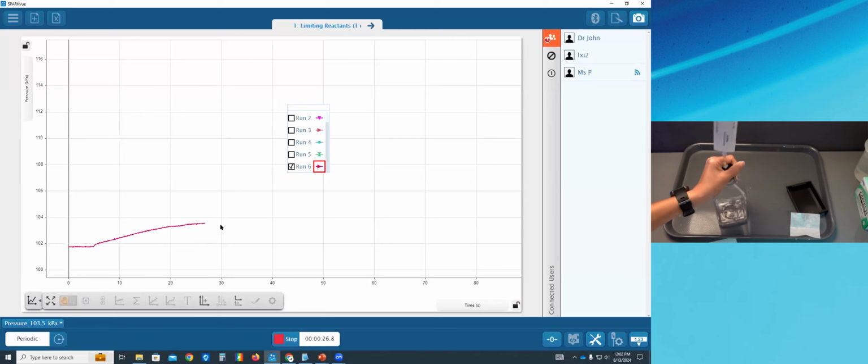And I'm going to on purpose mess up my data to show you how sensitive the equipment is. If I squeeze the bottle, this is why I'm not holding it down there, because that sensor will pick up that change in volume just by squeezing the container. Don't worry about this, not going to affect our analysis.